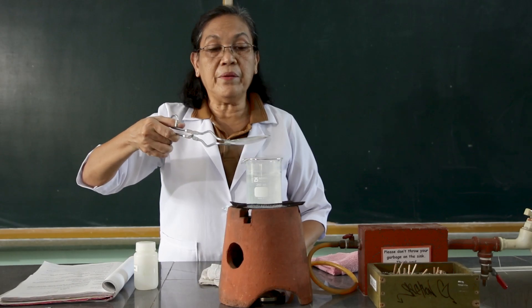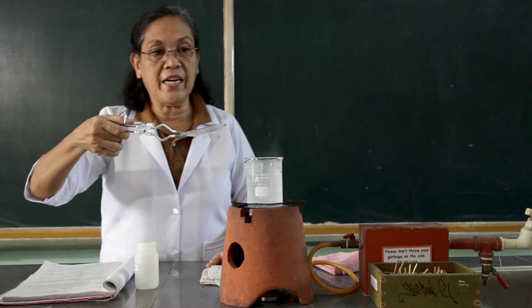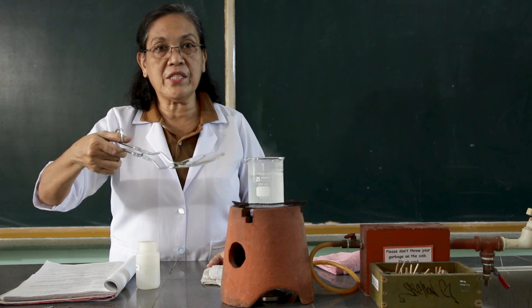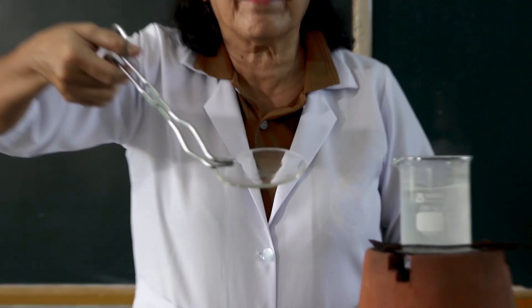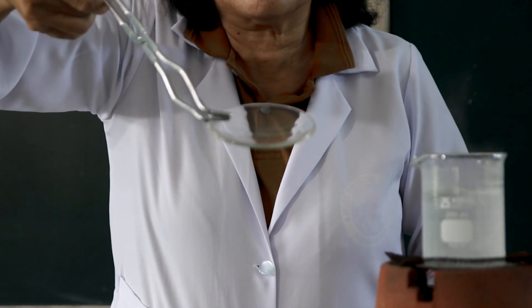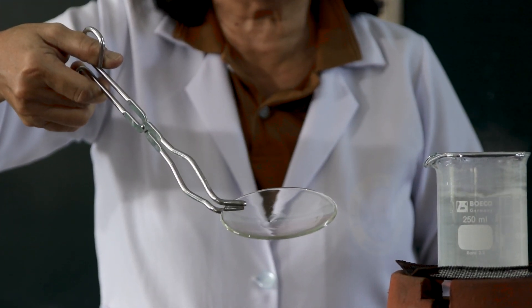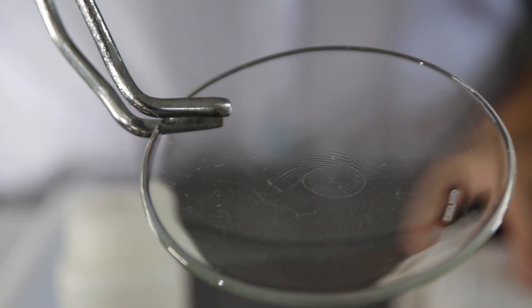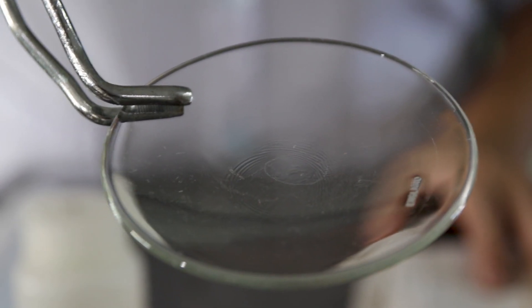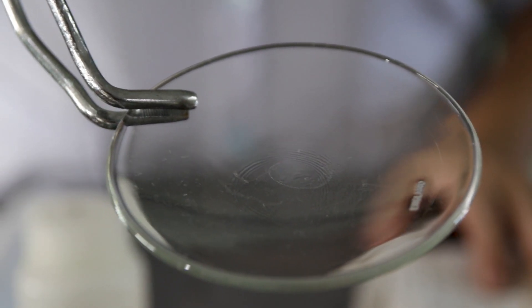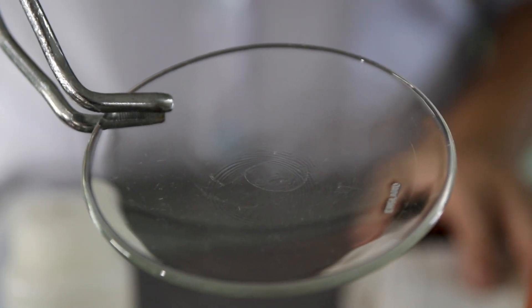Now, we have already evaporated off the ammonium hydroxide, and this is how it looks like. Now, observe what happens. This is the evaporated ammonium hydroxide.